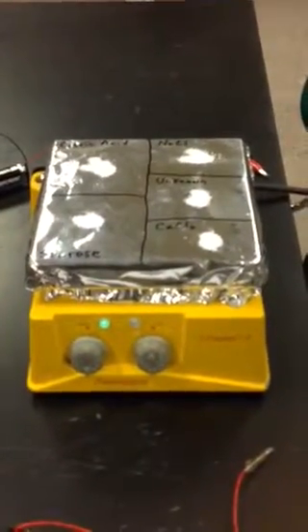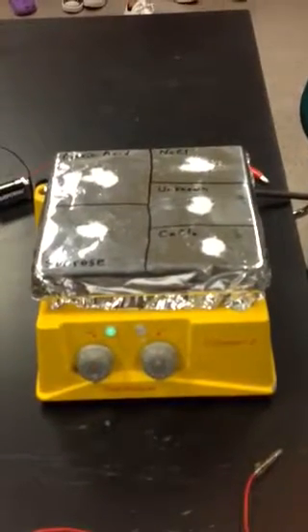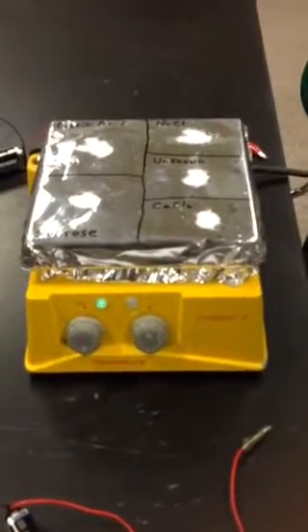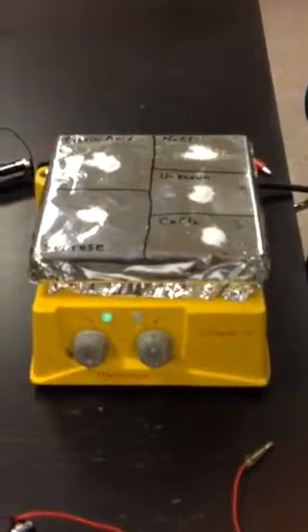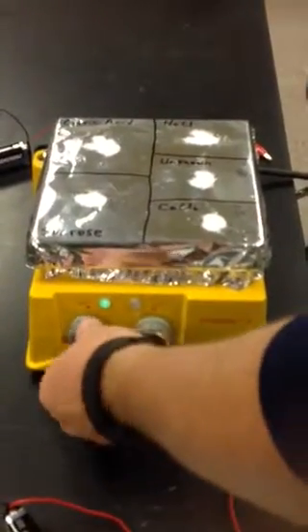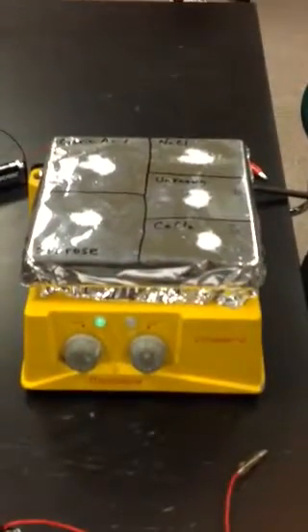If you turn it really, really low, it's not going to get cooler any faster because it's got to do it at a certain rate. All right, we'll blast it. See if that does any good.